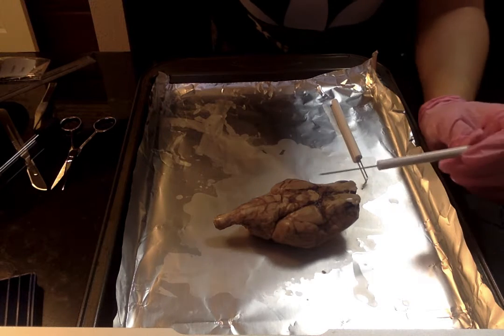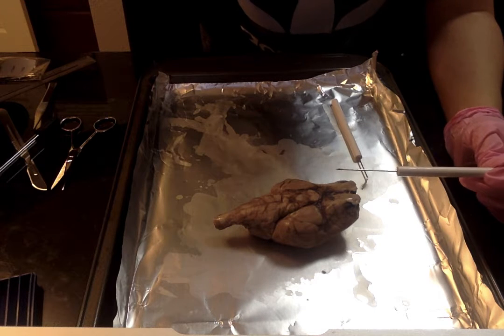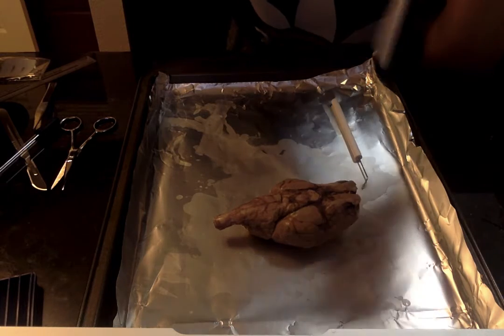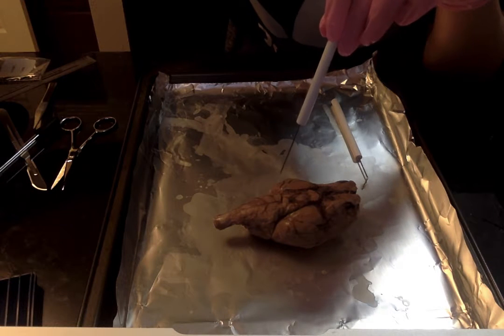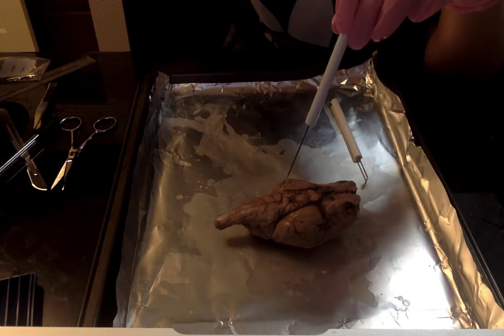But yeah, so the medulla is going to be responsible for regulating a couple of different basic functions of the ANS, such as respiration, cardiac function, vasodilation, and reflexes like vomiting, coughing, sneezing, and swallowing.